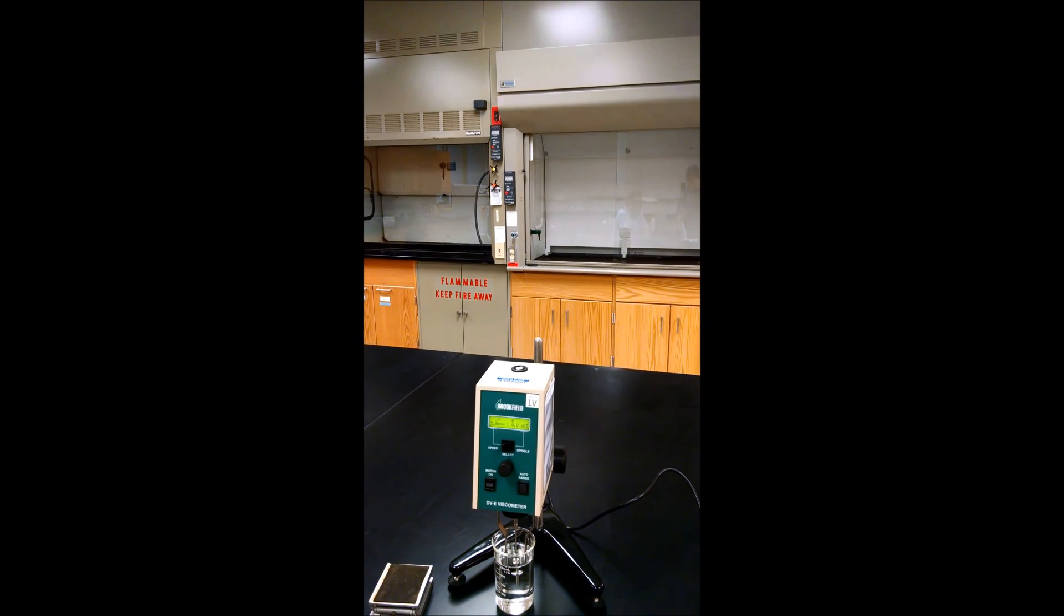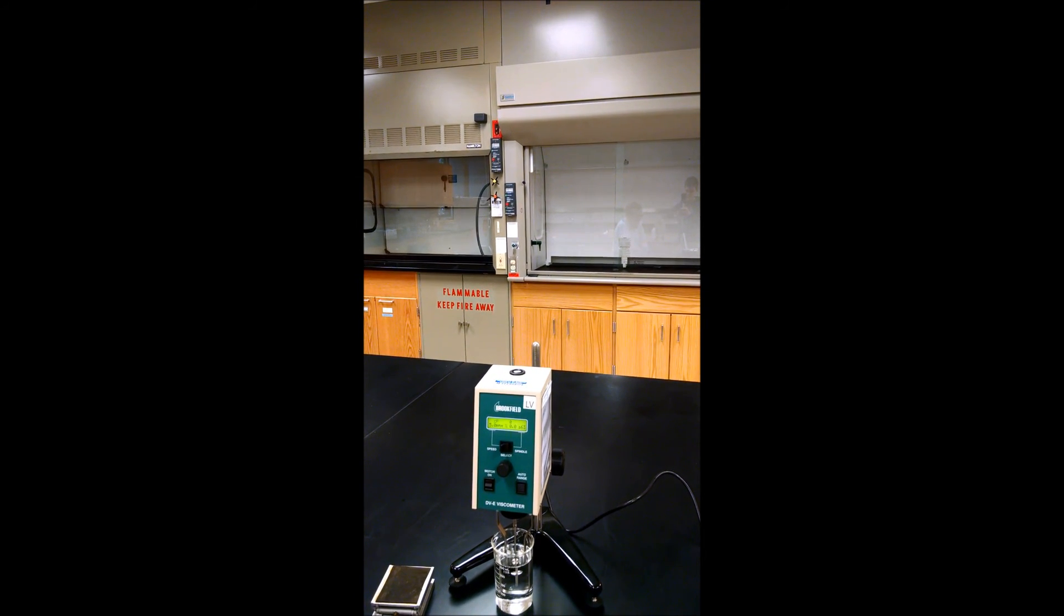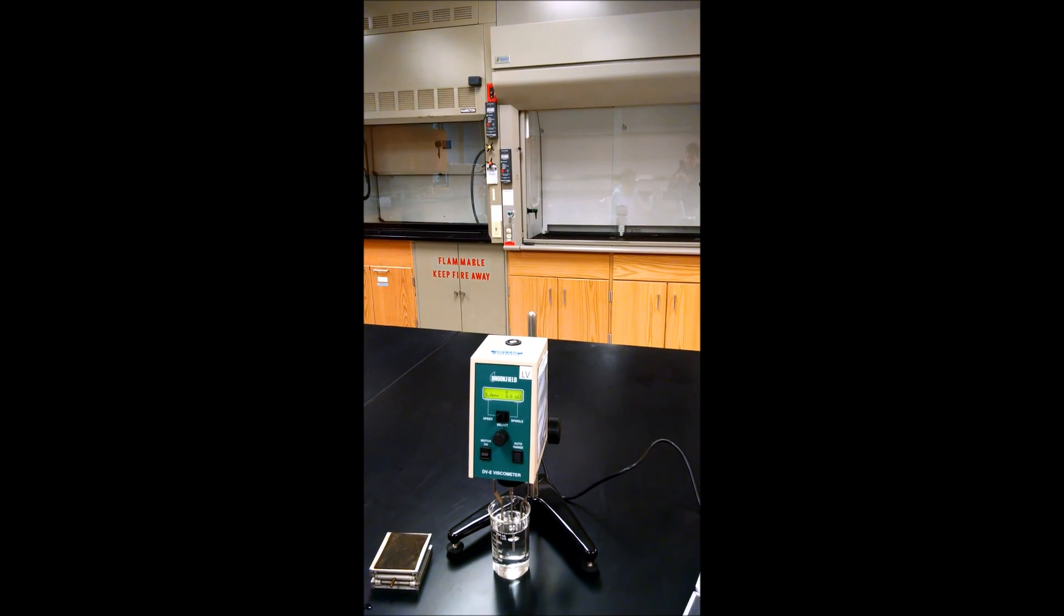This is blinking saying the measurement is under range. We have chosen the wrong spindle for this material. Since it's under range, that means we need to either go faster or get a larger spindle to measure this liquid.